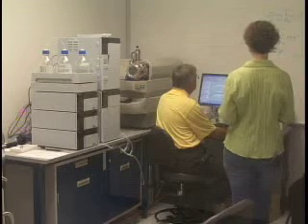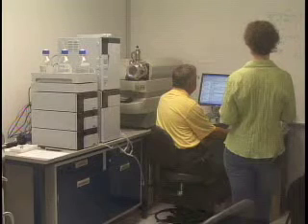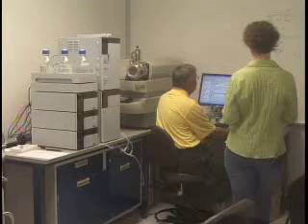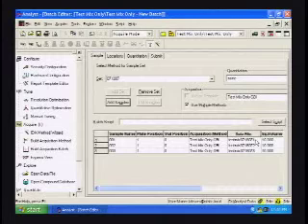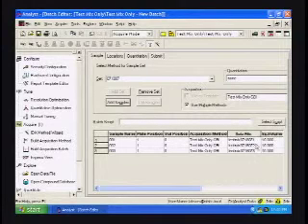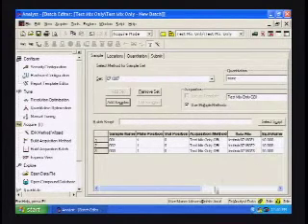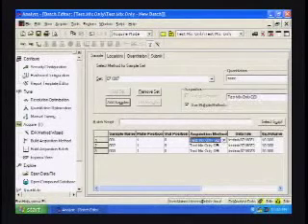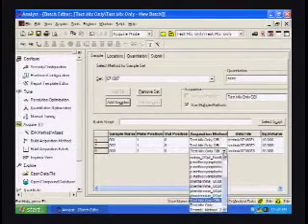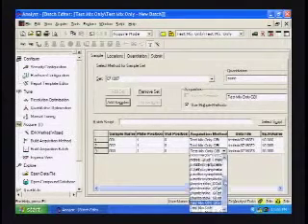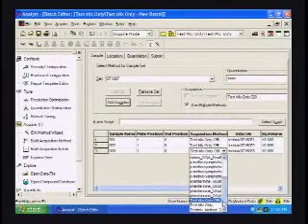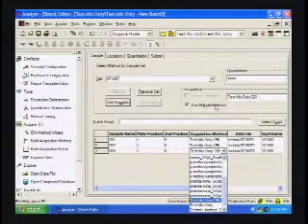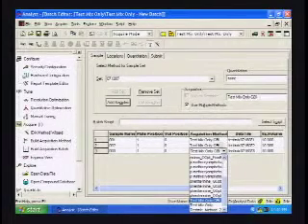But we can cover that when we actually go over data processing. And one way you could change this here is to change the file name designation at this point right here. Now here I clicked on this particular box and we can choose, if we wish to, a different method for any one of these samples. And it was because we clicked, had this box clicked earlier.